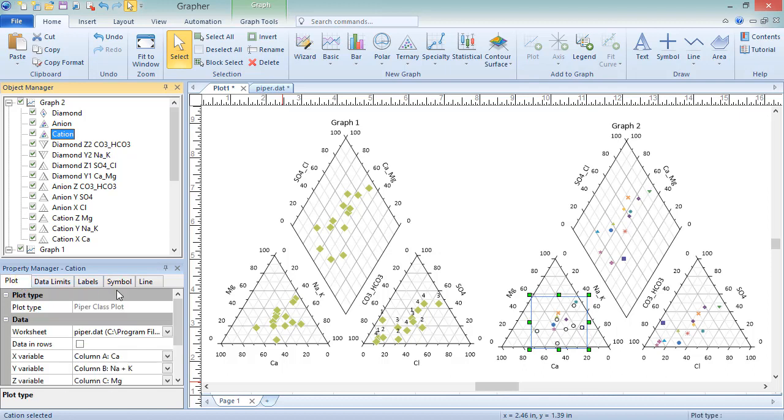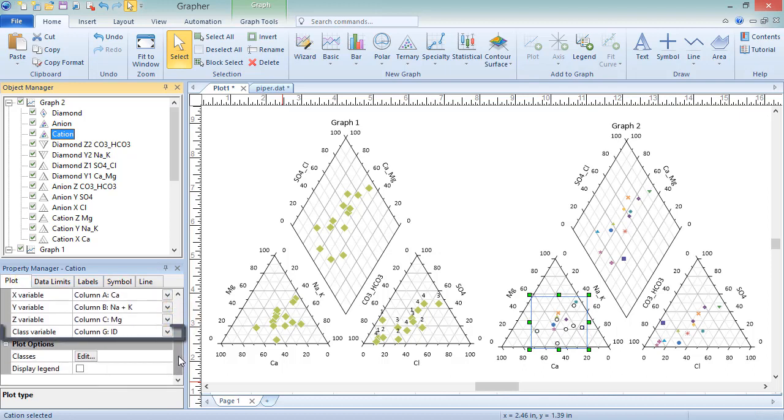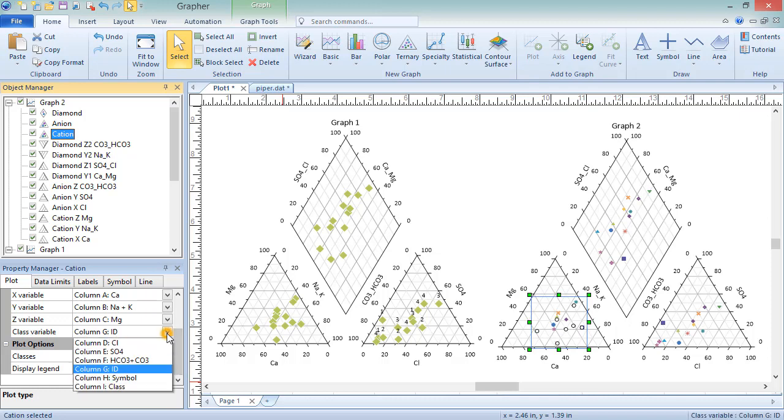but there are additional plot properties for setting a class column, editing classes, and displaying a legend. Class columns entries can be text or numeric.